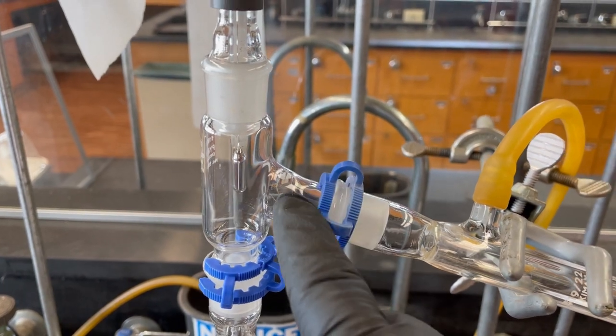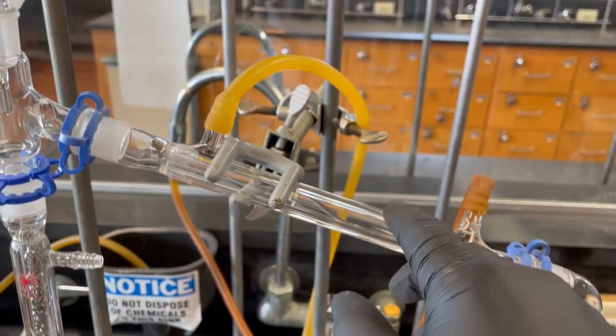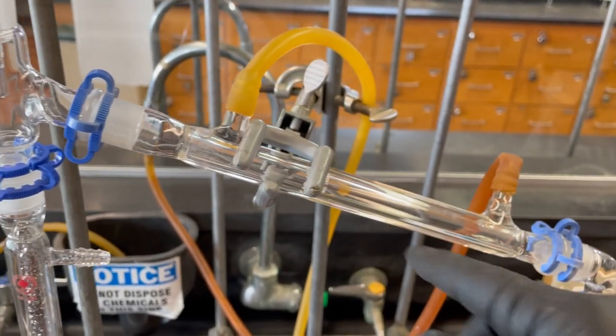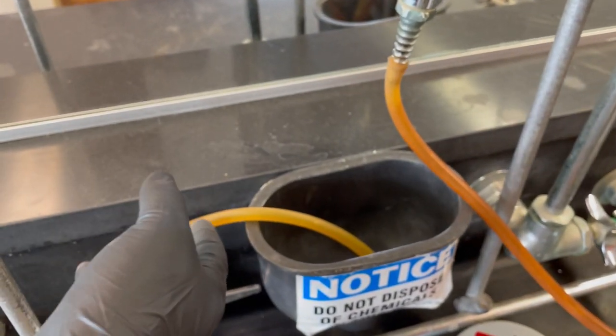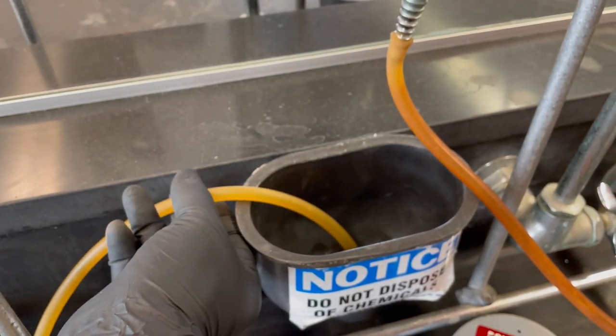So this distillation head is attached to another water condenser that is not packed with anything, but will have water running through it. So remember, I have the water going in here, coming out, and gently, so as not to waste water, I have it at a super slow flow.